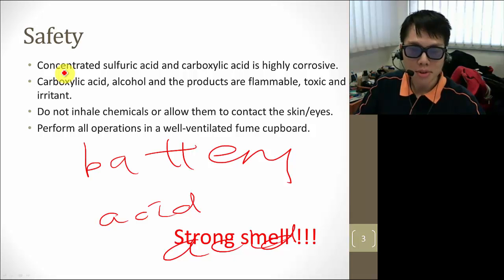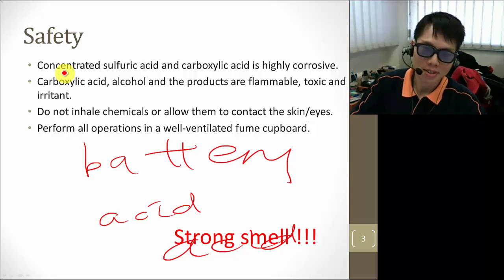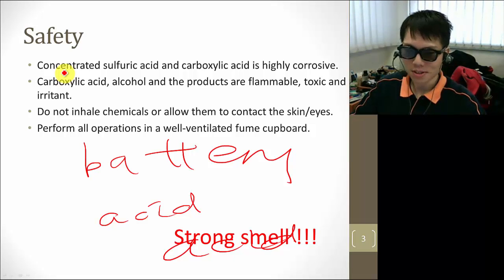And please refrain from rubbing your eyes, no matter how itchy it is. Use the eye wash at the basin if you need. And always transfer the chemicals inside the fume hood, because all of them have very strong smell. We can call it fragrance to some people, but not everyone will receive it as fragrance. So do be responsible and courteous.